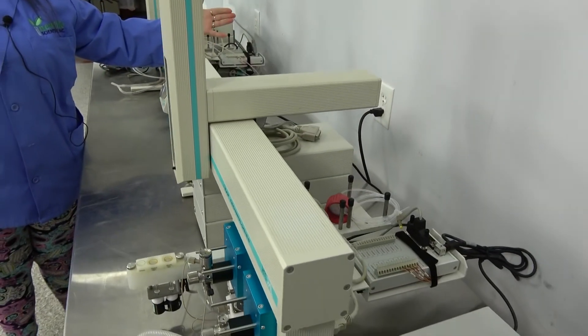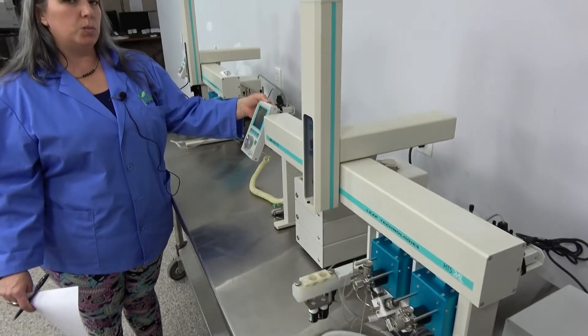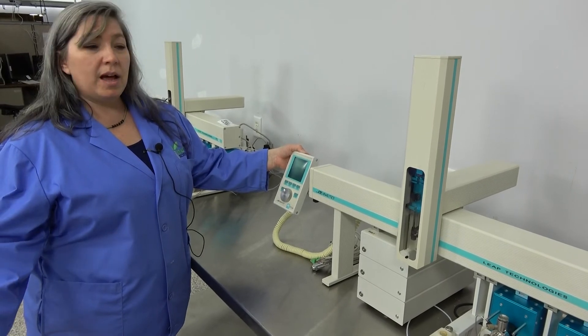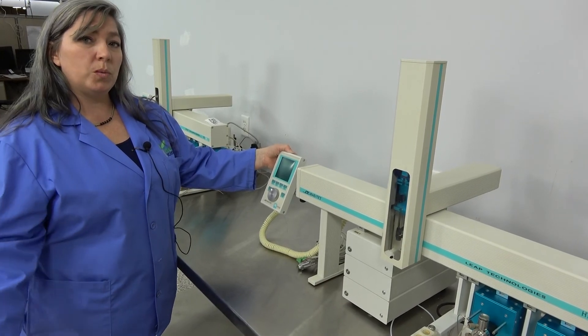And that is the PAL system. Here at New Life Scientific, we feature a 90-day limited warranty on all of our working items, and this item is included in that. At this time we have a few of these units on hand, and we would love to place one with you.